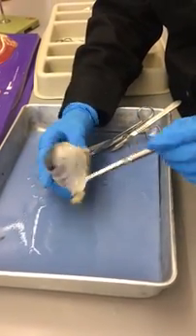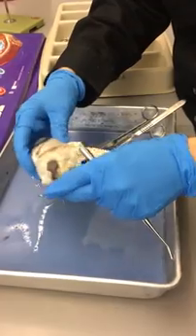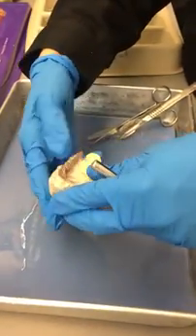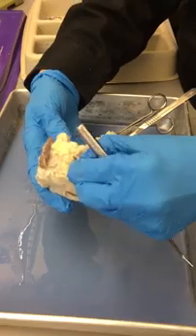Okay, so here is the cow eyeball. You can see that there's going to be a lot of adipose tissue around the cow eyeball. There's also going to be some of the muscles that help to move the eye. You can see some of these muscles over here. Here's the optic nerve right here.